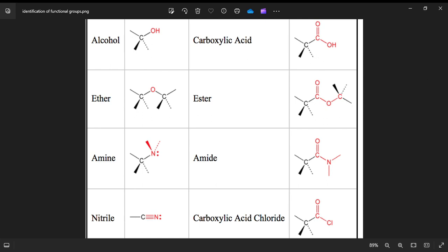acidic compounds under organic compounds are basically carboxylic acids or phenols. Then I told you in experiment 8 audio revision that carboxylic acid will dissolve in NaHCO3, that is sodium hydrogen carbonate, aside from dissolving in sodium hydroxide.